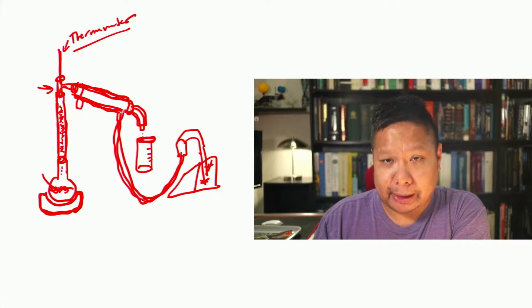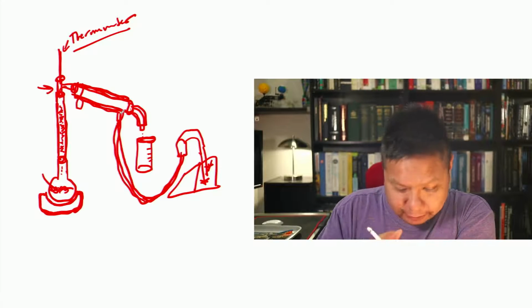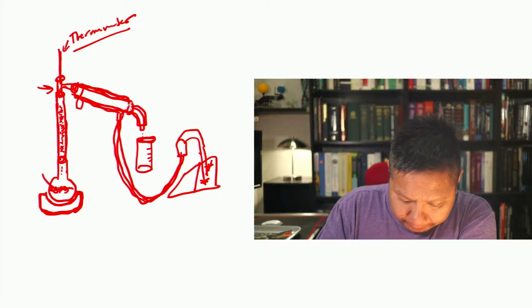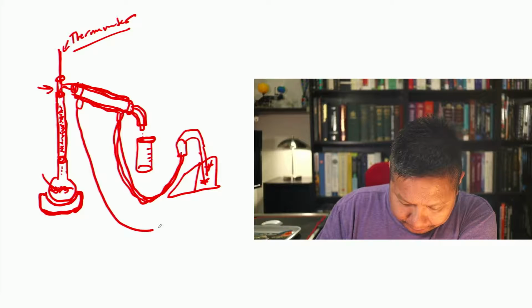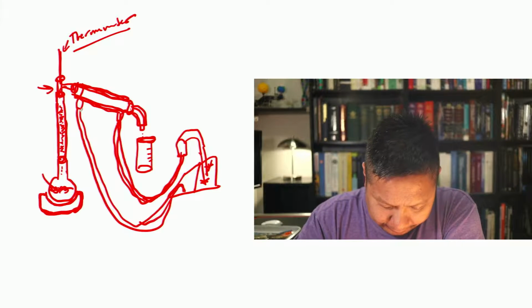And remember, I said it was dual layered. And so it will go into the layer that's outside, like the layer between the two glass layers, and flow and cover the entire condensing column with cold water. And then it will come out the other side here into the sink.